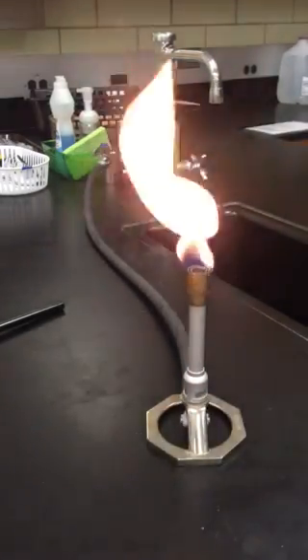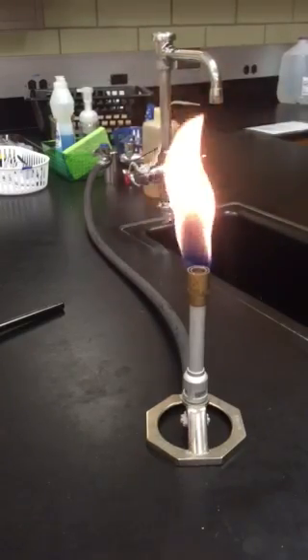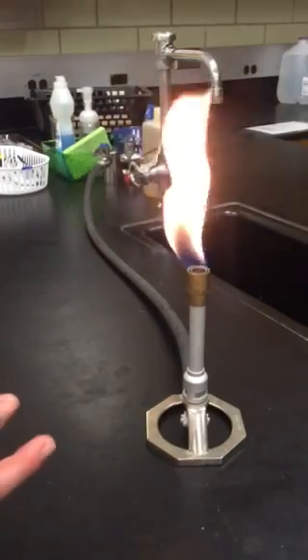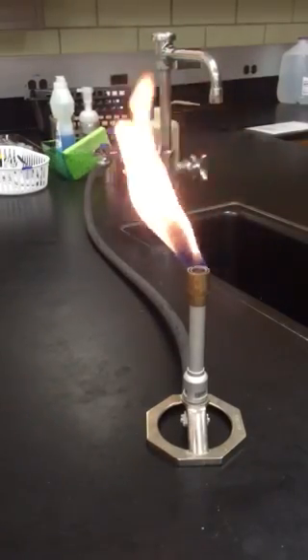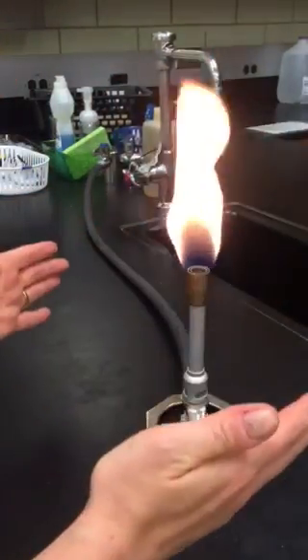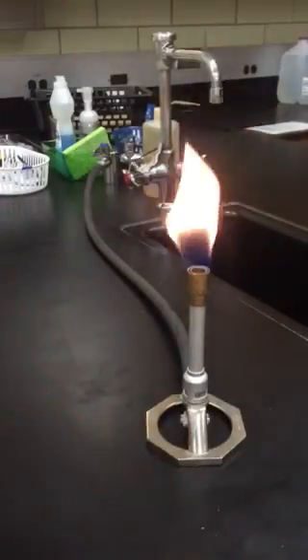You're going to notice that I have this bright yellow luminous flame. This is not a good flame to use for doing lab work for a number of different reasons. This is the flame we want to start off with because it makes it easy to see the flame, adjust the size we want, and then ultimately optimize it by twisting the barrel and introducing more oxygen.